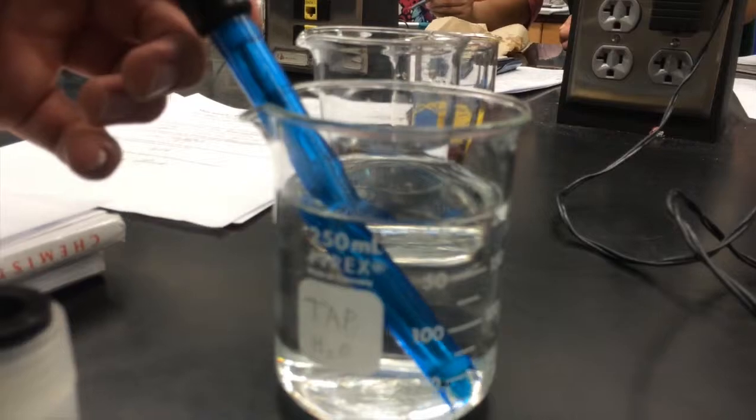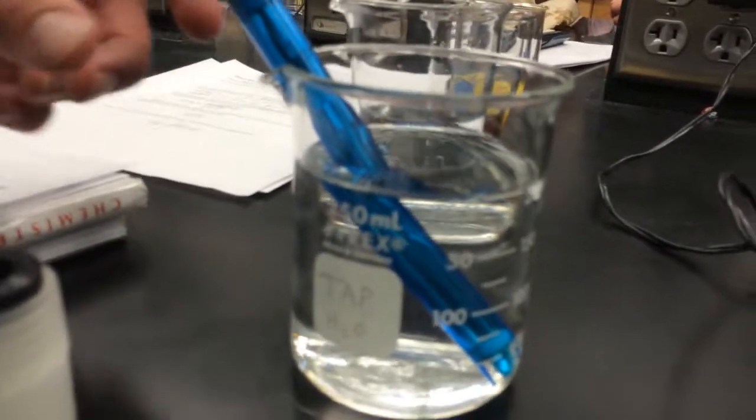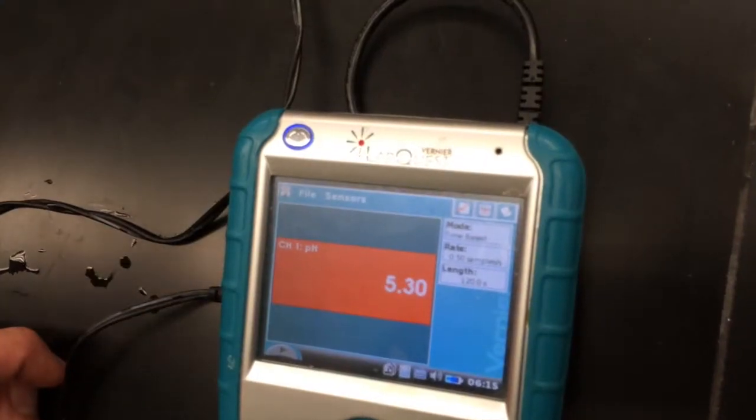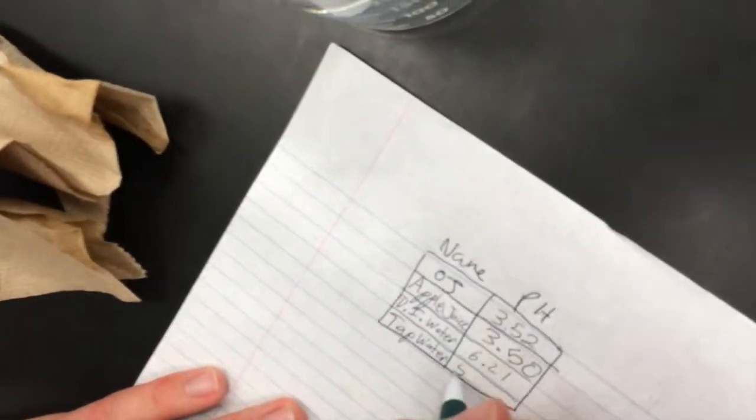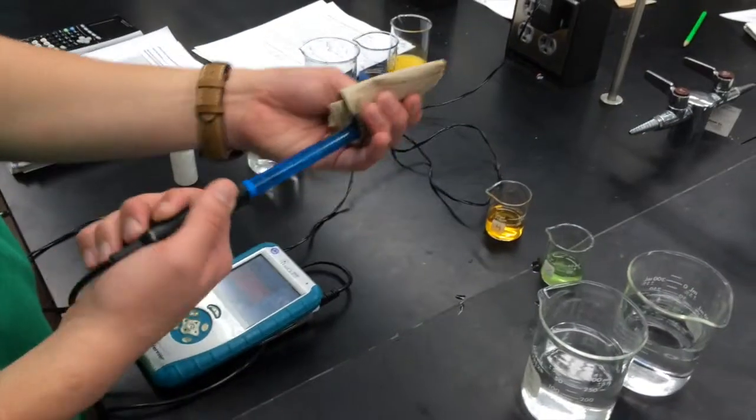Ben tests the pH of tap water, which comes out to be 5.30. Ben is now finished with the pH meter, so he begins to clean it for storage.